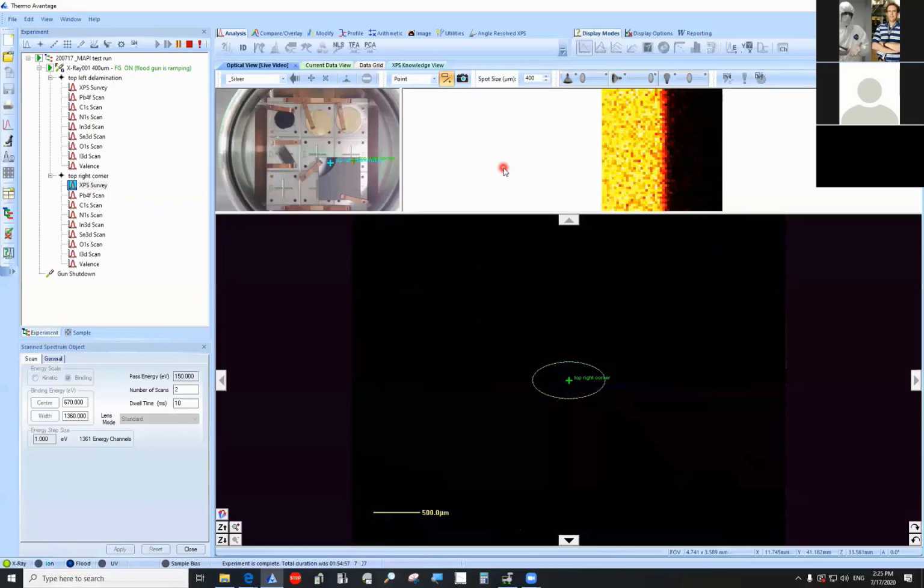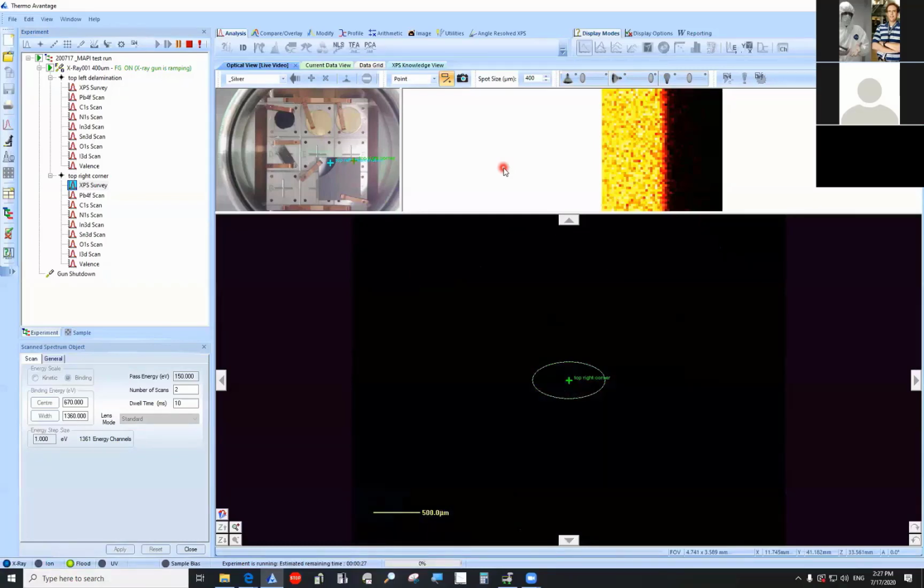This is particularly true of those people who are working on solar cells, right? If you have the flood gun on, it may or may not compensate for any additional charge buildup if you are generating photo carriers. So if I were you, I would just make sure the lights are turned off. And if I'm remembering correctly, there's a way to make sure that gets done for every single specimen.